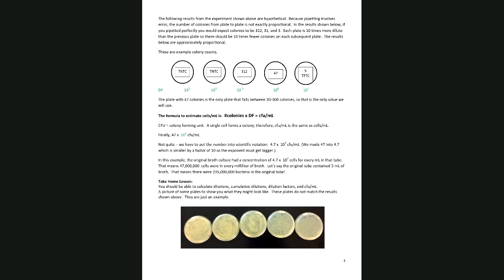Or if cells are in long chains, a spectrophotometer is not going to be able to interpret those data, to give you an accurate estimate. So our web calculator actually was just designed to work with E. coli in the spectrophotometer. So it doesn't work for other kinds of bacteria.